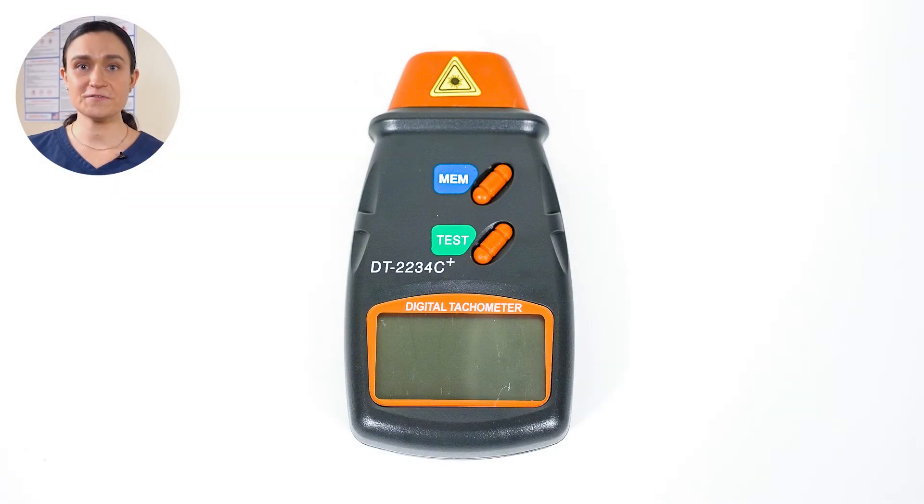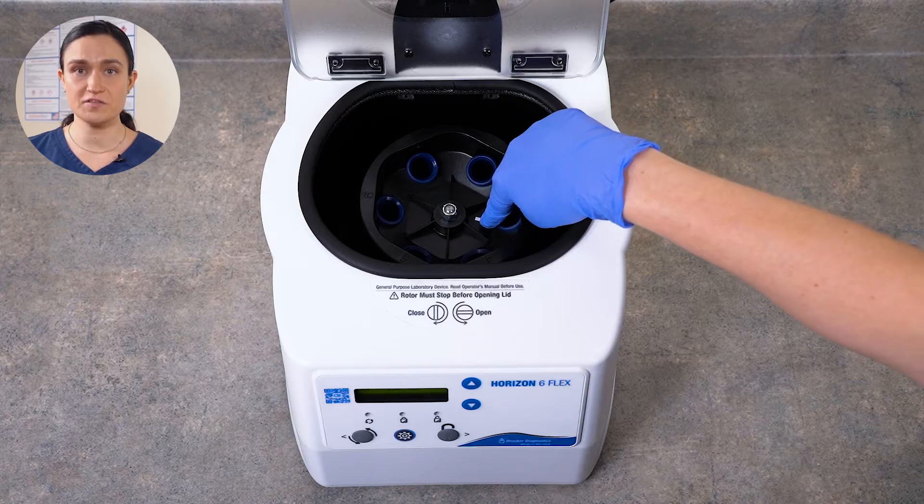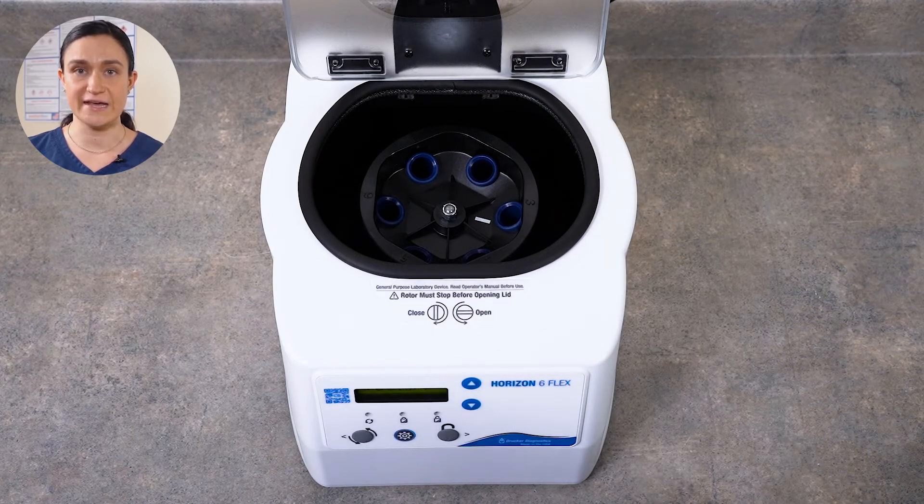Your Horizon 6 Flex does not require any regular maintenance, but you may wish to confirm the spin speed. To do that you'll need your facility's calibrated photo tachometer — ours is shown here for reference. Your rotor has a reflective strip on it so the photo tachometer can easily detect the speed.